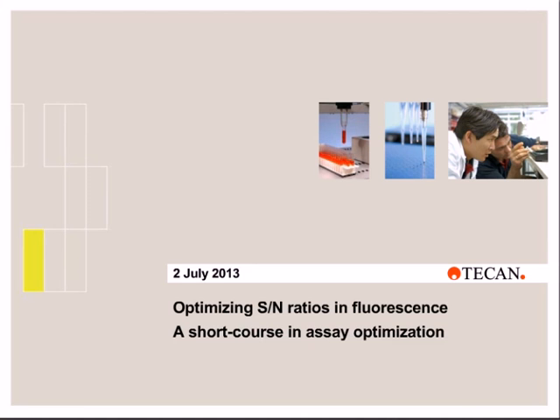The webinar will present clear and concise information on how to optimize the performance and get better results from your plate reader. For example, it'll be shown how to select the most suitable excitation and emission wavelength, and what influence the bandwidth has on the signal. Furthermore, for cell-based assays, the optimal read function is discussed and how this improves results for live cell-based assays. The webinar also focuses on fluorescence detection and helps researchers fine-tune the plate reader settings for optimal performance.